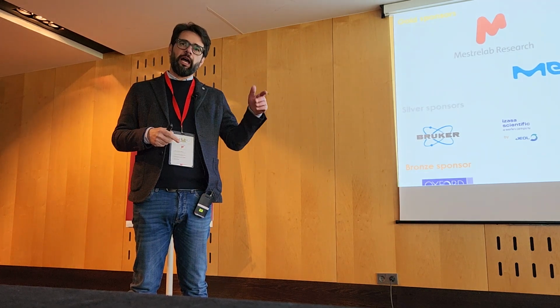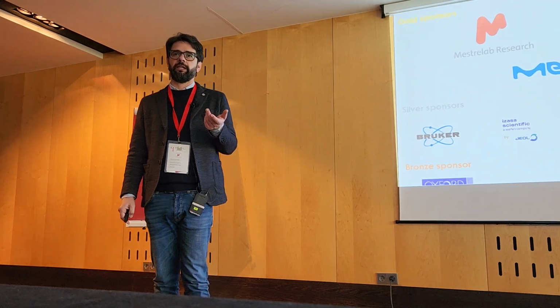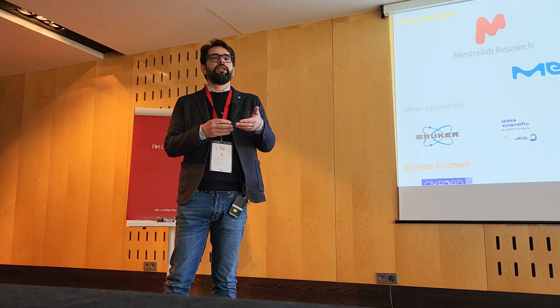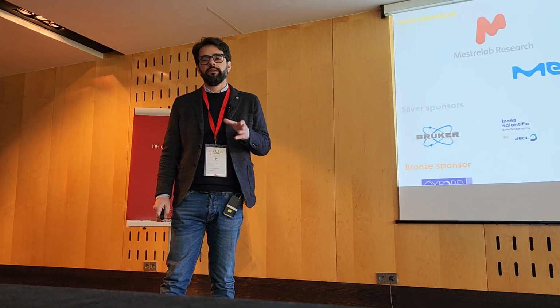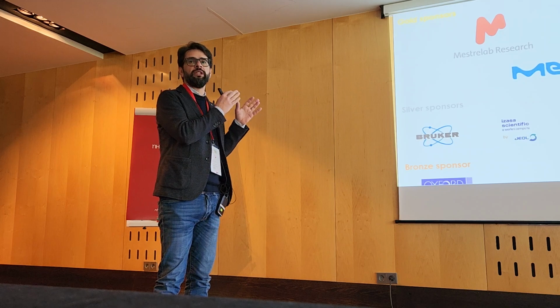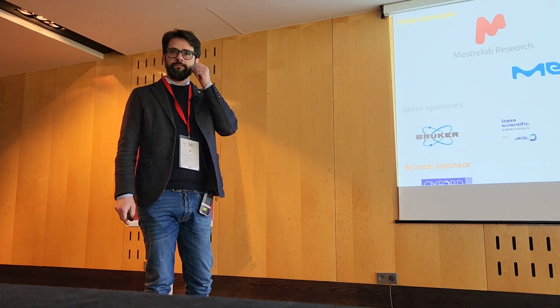Of course, afterwards we will add the error deriving from the sample preparation. But that error is a normal error that you meet for every method. That's why we are now focusing our attention on the error coming from the NMR spectroscopy.